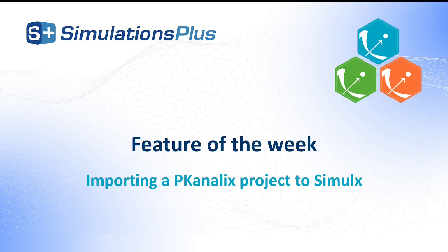You probably already know the workflow when importing a Monolix project to Simulx. If not, I have linked the video for you.